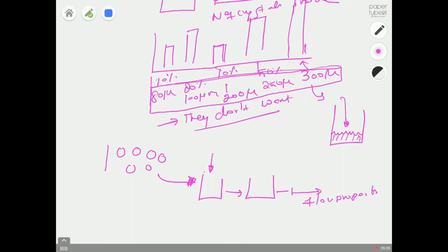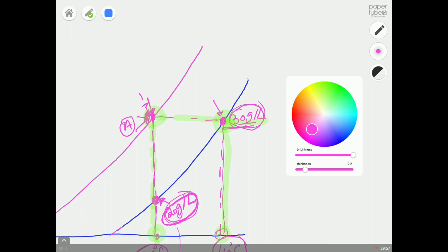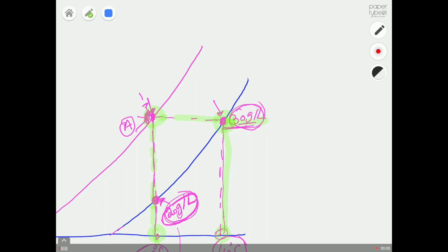So they want controlled conditions where they can control the crystallization experiment. They don't want this one, and exactly this is what happens when you nucleate your solution. Just to go back to the same graph, let me change to a new color. Follow the red arrow: you start your experiment at 30 grams per liter and then you cool back to point A, which is here. Your solution will change from clear to cloudy, and if you give enough time, the crystals will grow until your concentration reaches 20 grams per liter. That's your solubility point. So 30 minus 20, 10 grams per liter, will be crystallized.